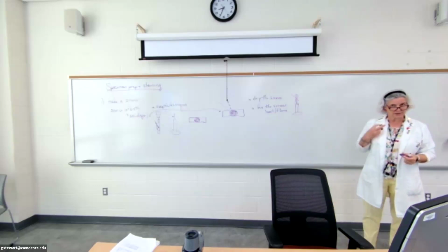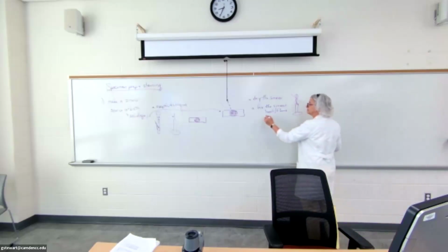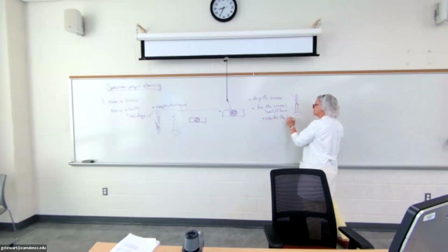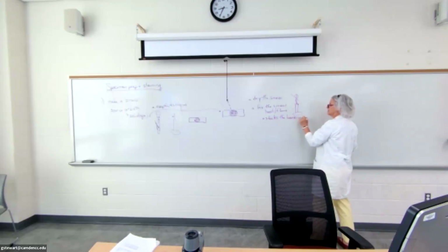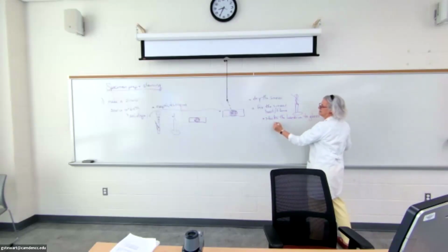And the fixing of the smear does 2 things. So this will help you answer that question in your lab report. The fixing of the smear does 2 things. First thing, let's say the first thing, the most important thing, it sticks the bacteria to the glass of the slide. And this is 2 parts.